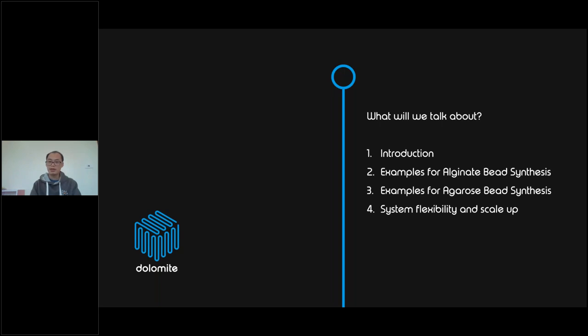So let's start with the presentation. The content of the presentation today will include the introduction and an example for alginate bead synthesis. After that, we move to an example for agarose bead synthesis. And finally, we will talk about system flexibility and scale.